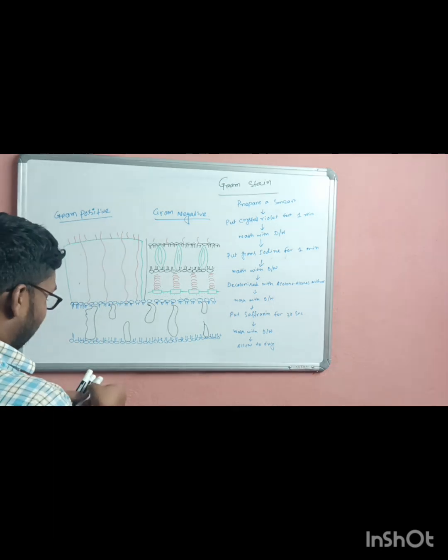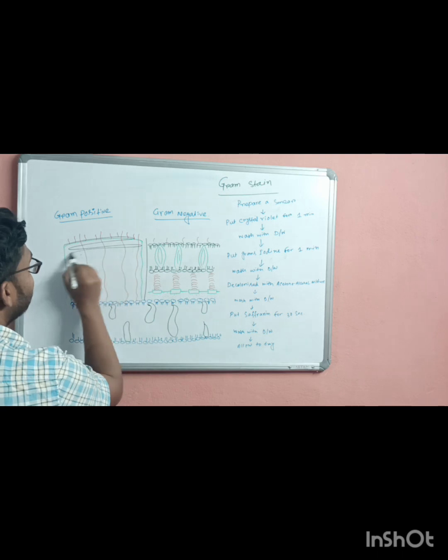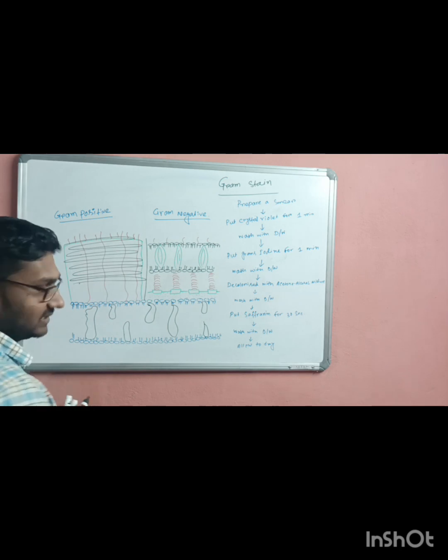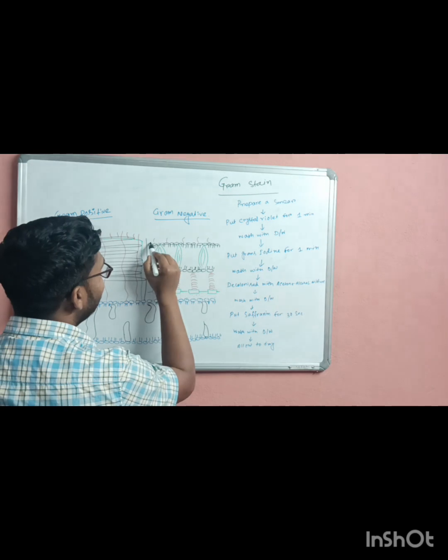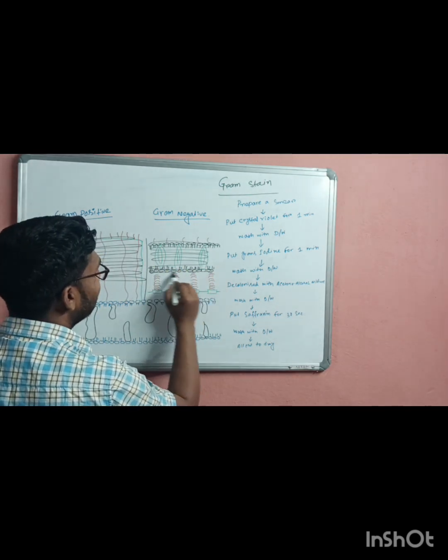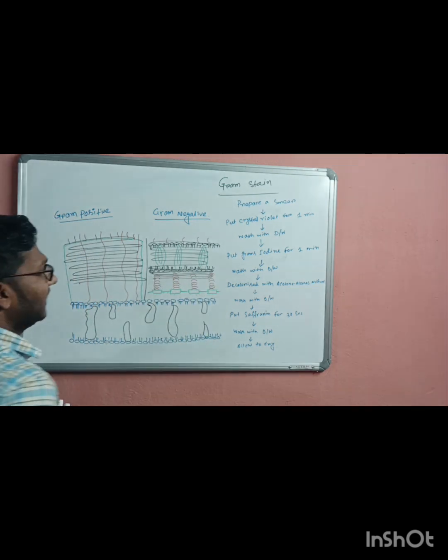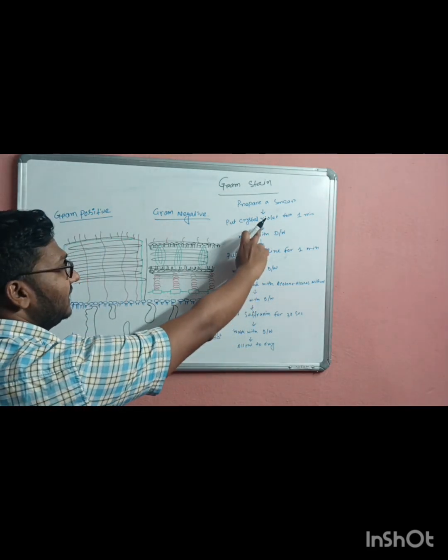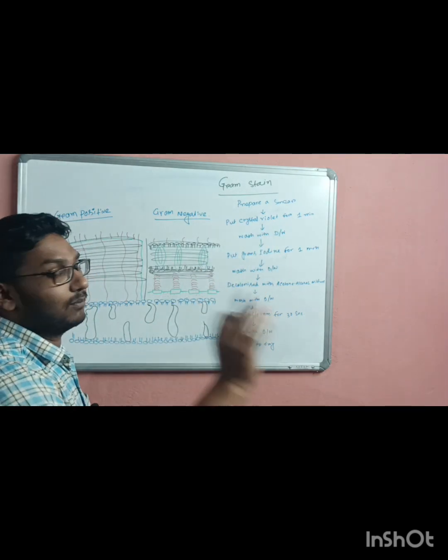at that time gram positive bacteria take the primary stain, and gram negative bacteria also take part, taking the crystal violet solution on the upper portion. Then comes the procedure: we wash with distilled water or tap water.